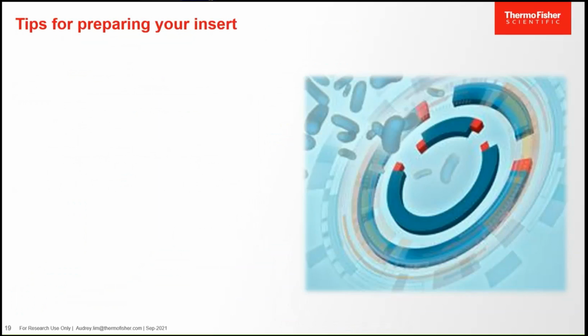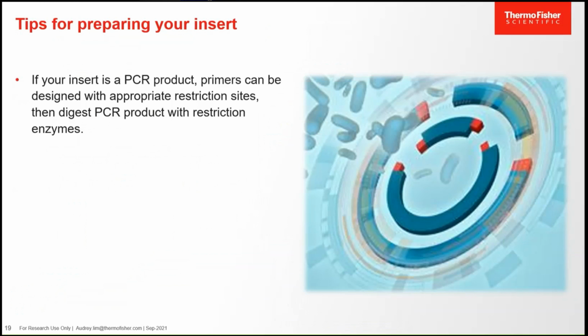Okay, so before we move on to the next topic, here are some tips for preparing your insert. First, if your insert is a PCR product, you can design your primer with the appropriate RE site so that it can be digested with the restriction enzyme.